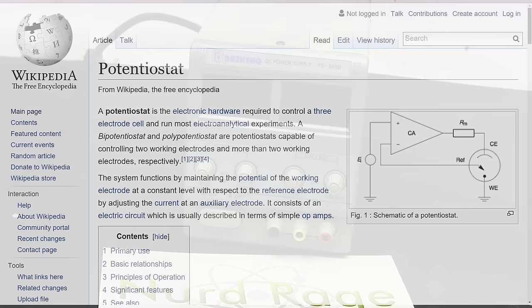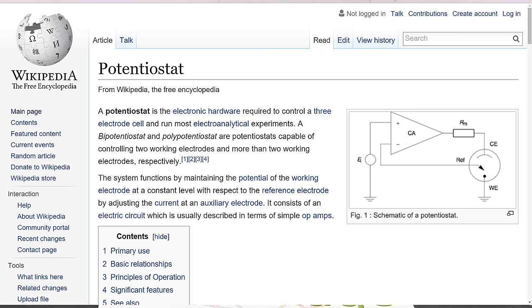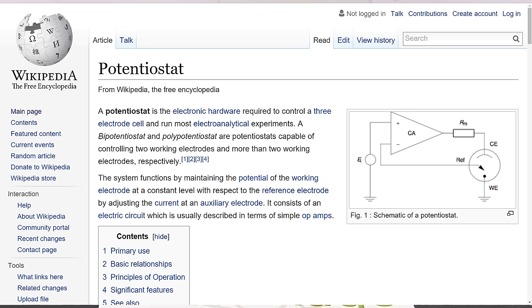Now there's a very advanced type of chemistry power supply called the potentiostat. These connect to three electrodes and let you perform an even greater range of electrochemical experiments. Unfortunately I don't have one yet to show you but if you want to do professional level electrochemistry experiments this is the sort of power supply you should be looking for.